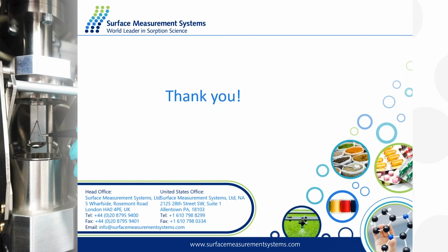Just a follow up, Sabiyah, how much sample do we need for an iGC or DVS experiment? With the iGC-SEA, it's dependent on the BET surface area of your samples. If you have a relatively high surface area material, such as activated carbon, you'd want to use very small amounts of material, about 10 milligrams. However, if you have samples with very small BET surface area, you want to use quite high masses, around 100 milligrams.